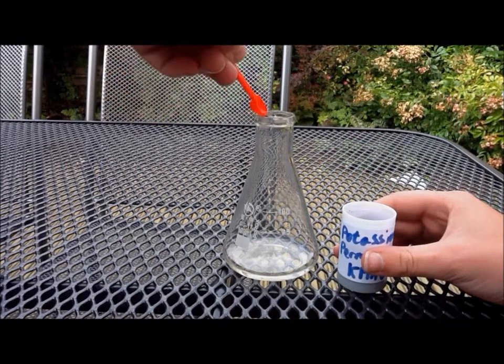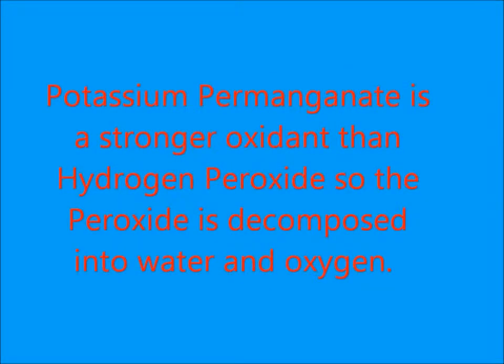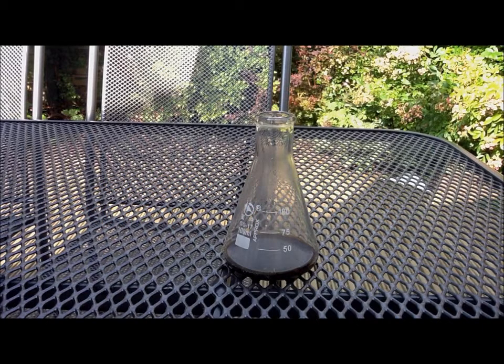And get ready because it happens instantly. Thank you. So that's hydrogen peroxide and potassium permanganate.